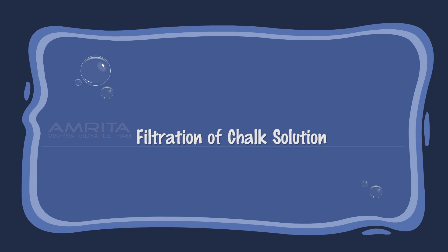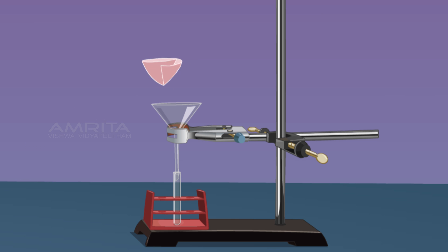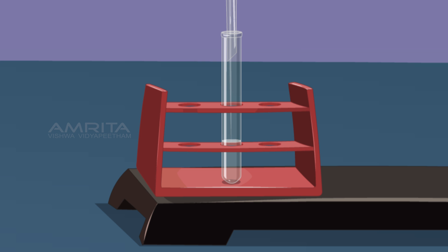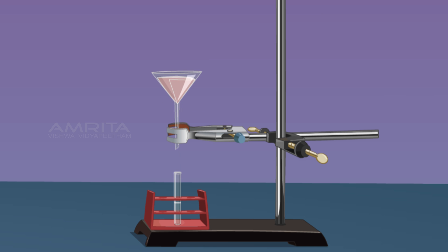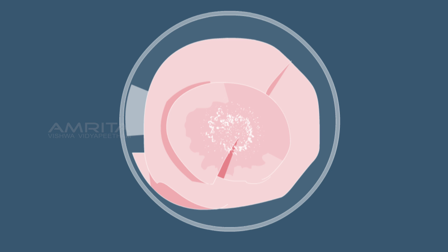Filtration of Chalk Suspension: Place a funnel over a test tube using a clamp stand, then place a filter paper in the funnel. Now pour the chalk suspension through the funnel. A clear filtrate is obtained and chalk particles are seen on the filter paper. This indicates that suspended components of a suspension can be separated by filtration.